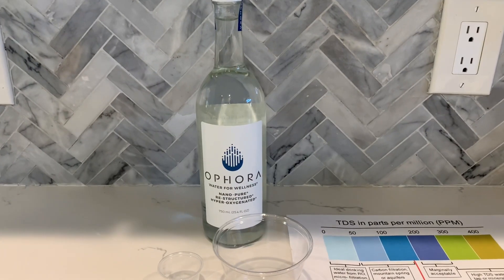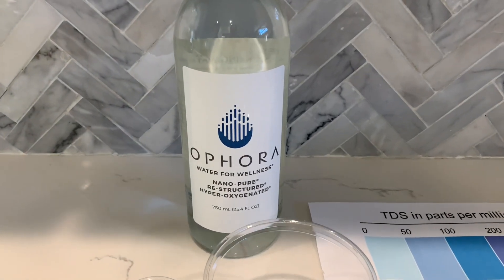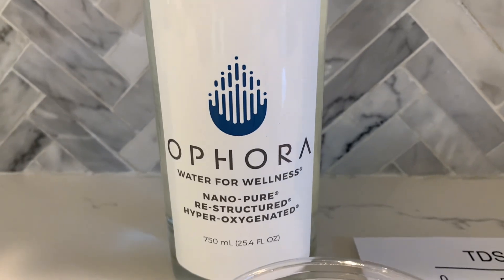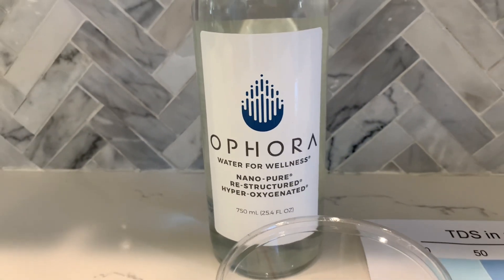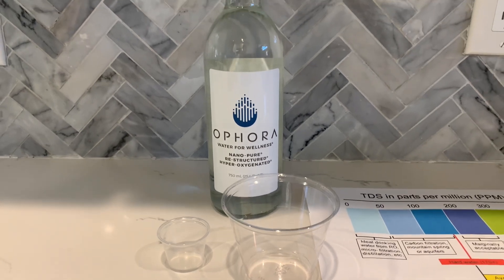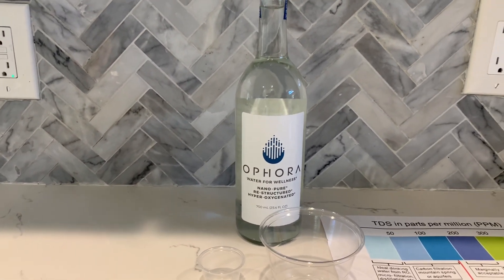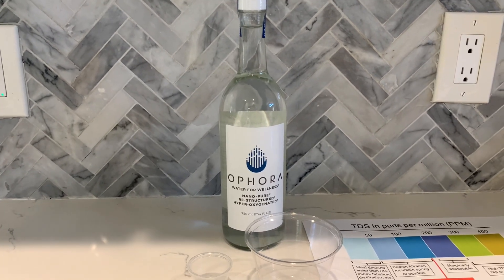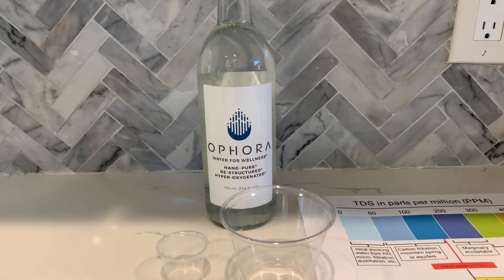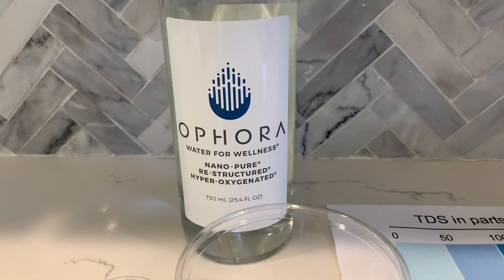This is Afora NanoPure Restructured Hyper Oxygenated Water for Wellness. The bottle is sourced from Santa Barbara, California. According to the bottle information, the TDS is supposed to be 40 ppm and the pH 8. Afora bottled water costs $13.99. It is the most expensive water that we have tested during these four years. Overall, we tested approximately 500 bottled waters.